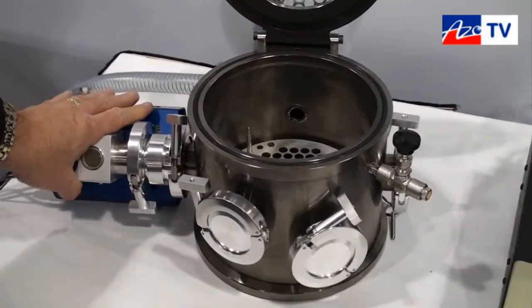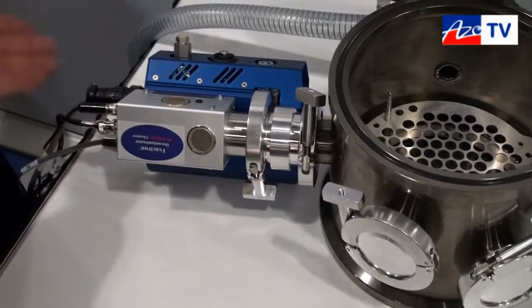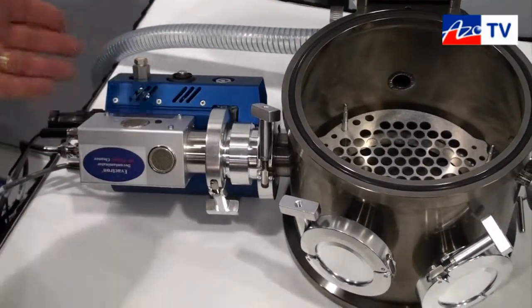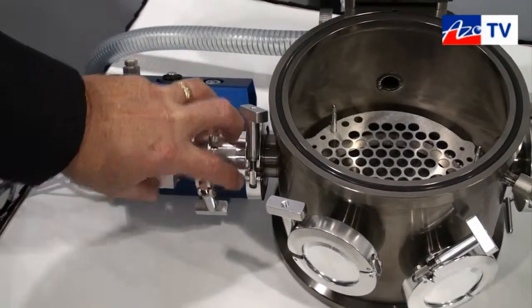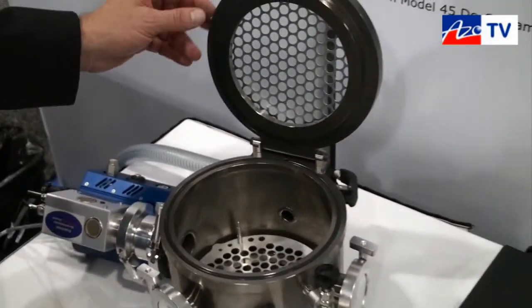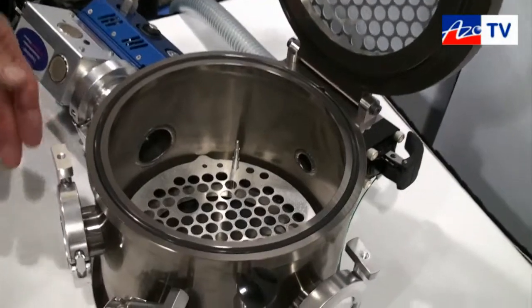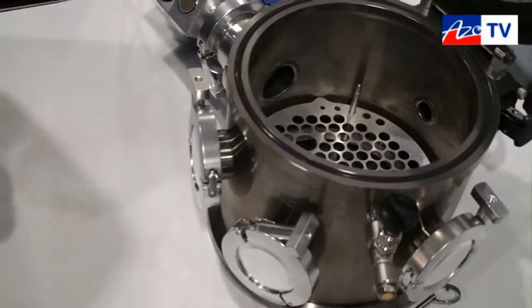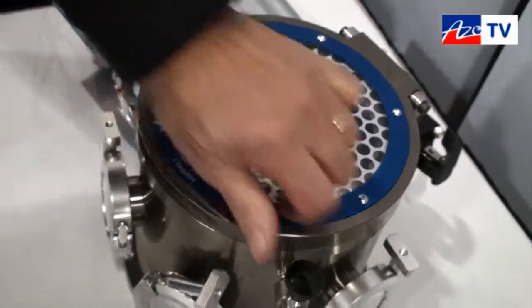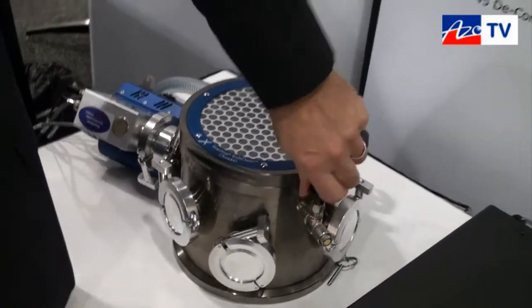This is the actual plasma radical source. The gas that we use is most commonly air, so we're using the oxygen radicals in the air to do the actual work. The plasma stays inside here, and the gas molecules will move into the chamber. This is a small chamber that people use to clean in. They can take their samples, put them in there, and insert transmission electron microscope specimens and holders in through these ports as well. We'll pump it down and let it do its thing here while we talk about the controllers and the systems.